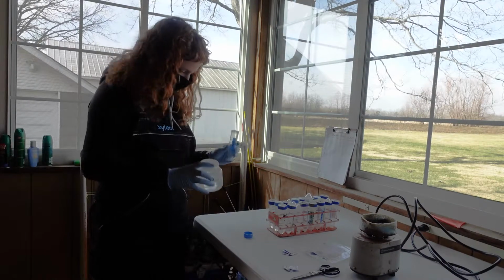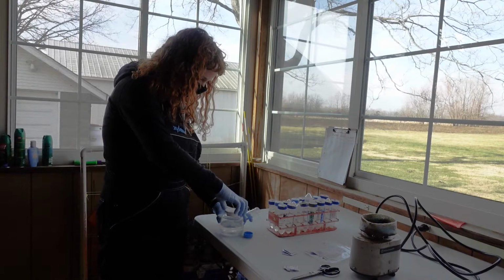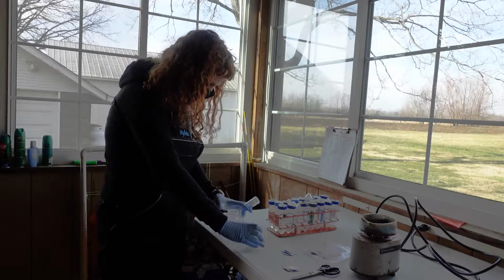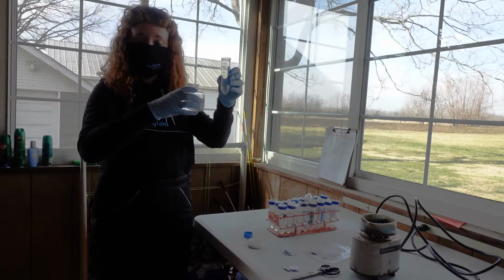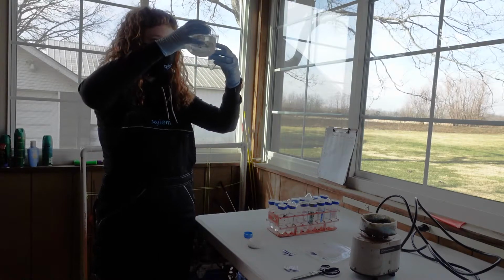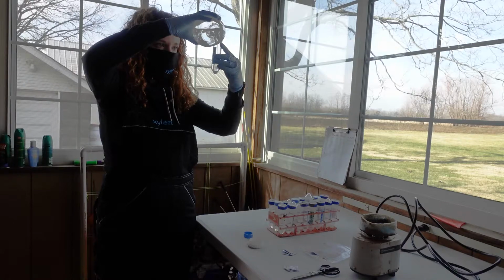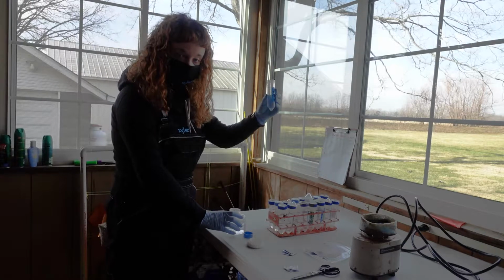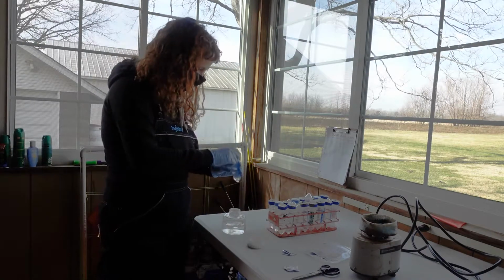So I've inverted. I'll open my sample, and I'm going to pour to the 25 milliliter mark. And usually I'll hold this up to about eye level so that I can see that level. All right, so I've poured into the tube labeled 1.